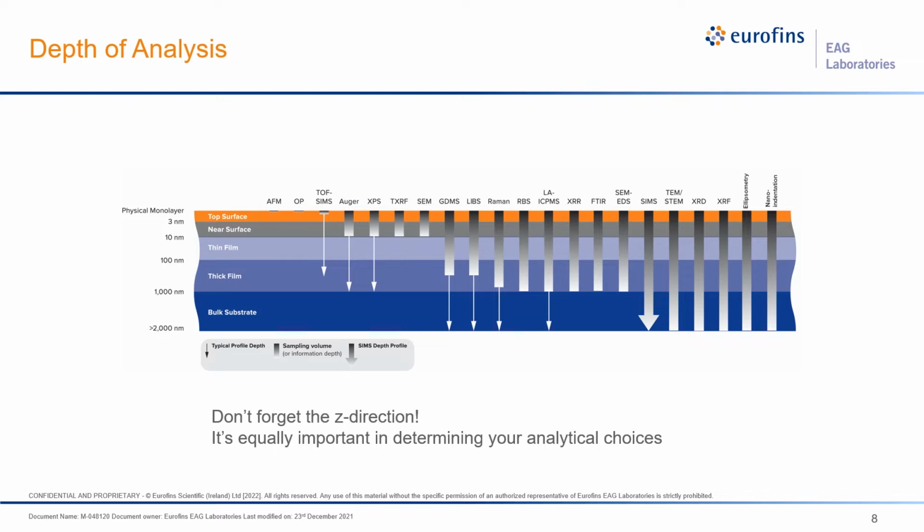Let me stress that the information provided in this figure and in the smart chart illustrates that there is no single technique suitable for all analytical problems. We need to tailor our choice of tools to what we're trying to measure, and in many cases, combining different techniques that provide different information will help solve some of the more complex analytical problems that we are confronted with in our daily work.